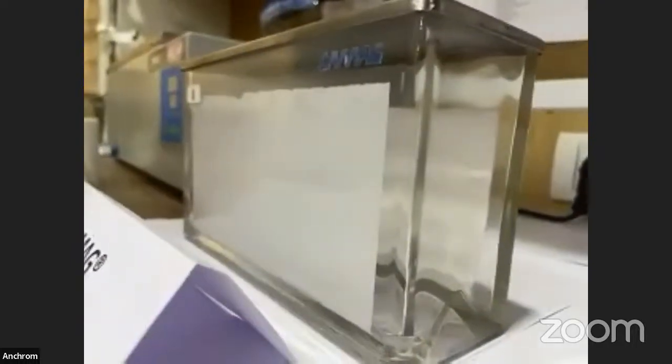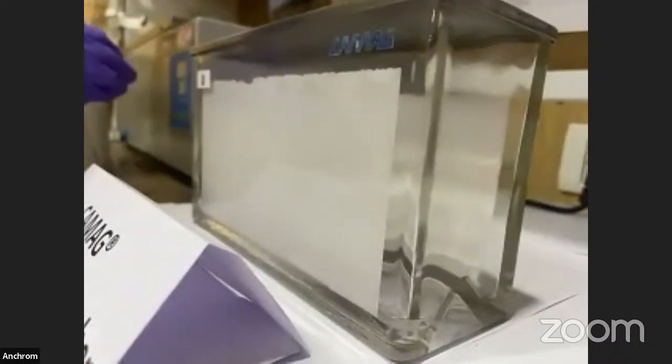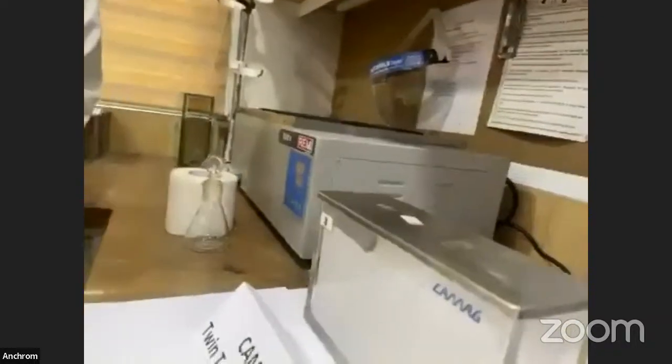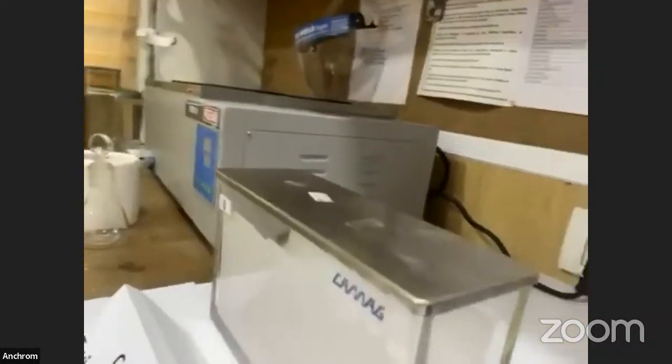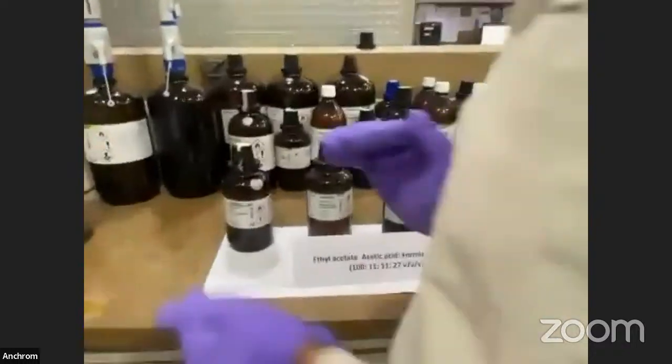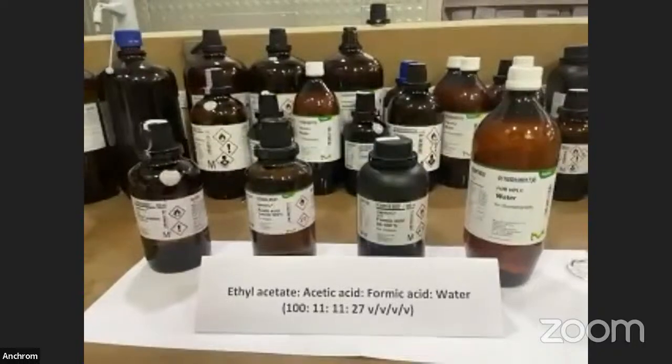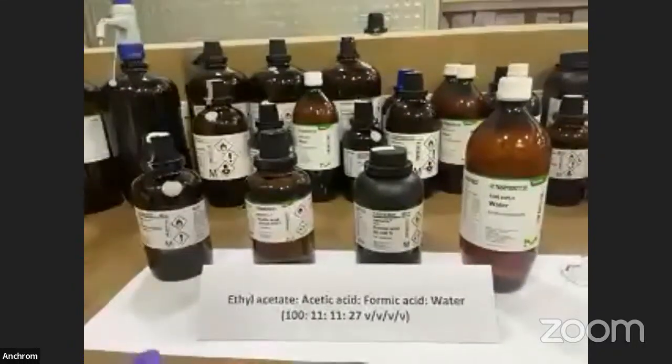As you can see, the mobile phase is rising over the stationary phase, and the components are being separated from your samples. So for the development of the samples, we have used this mobile phase.